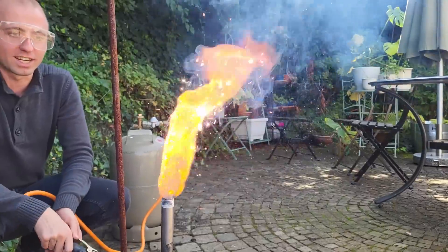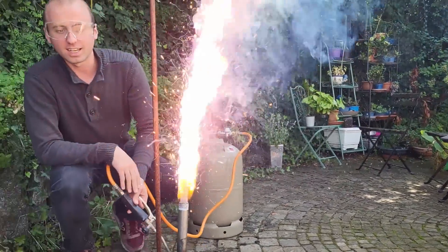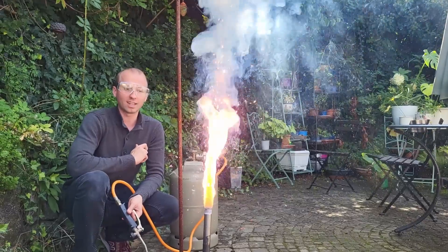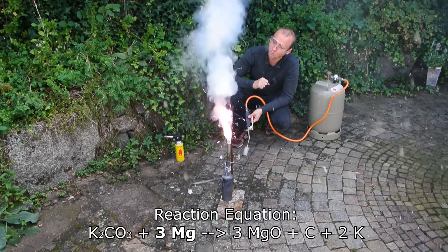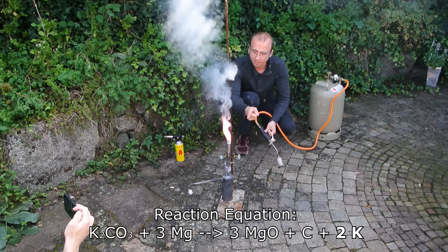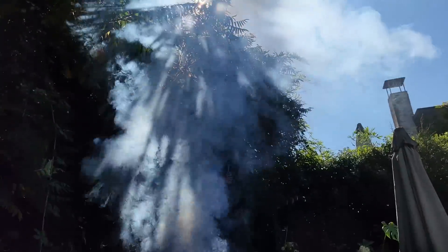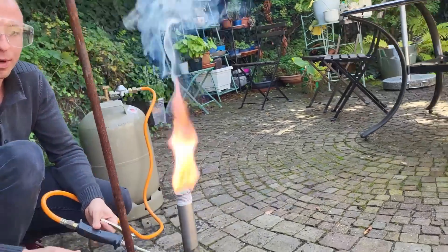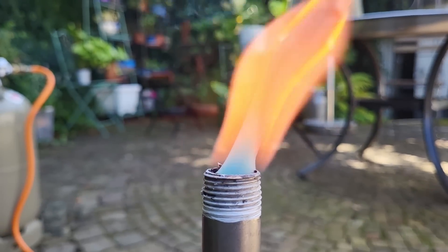Now it's reacting, as you can see by the nice fireworks. That's caused by some of the magnesium getting flung out — actually a bit more violent than last time. During this process, the potassium carbonate reacts with the magnesium metal forming magnesium oxide, carbon, and our potassium metal which we can then distill. By the smoke you can see we're definitely losing some potassium to evaporation — you can see the nice green potassium vapor if you look closely. That's potassium metal evaporating; it has a green vapor.